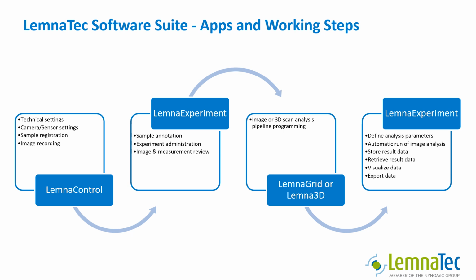The LemnaTec software suite consists of apps that cover different working steps. LemnaControl serves to control the system, to do technical settings, and to record images. LemnaExperiment is for experiment management and to run analyses. These analyses are programmed in LemnaGrid or Lemna3D. Finally, LemnaExperiment serves to display the results of the analysis.